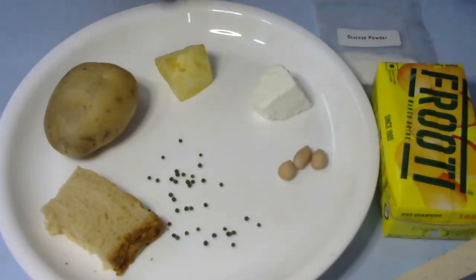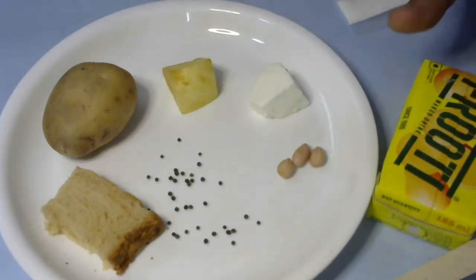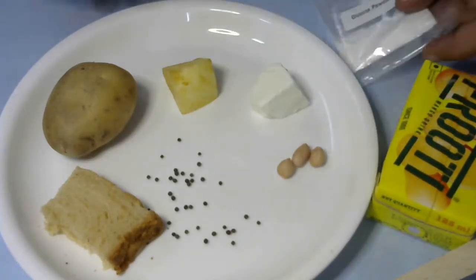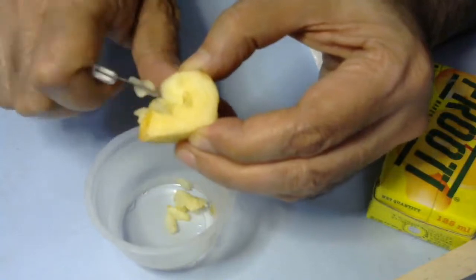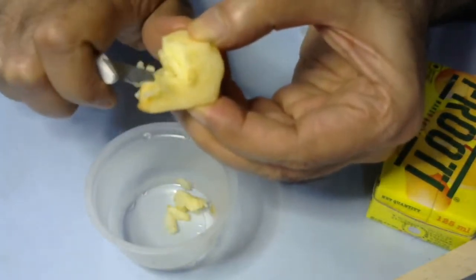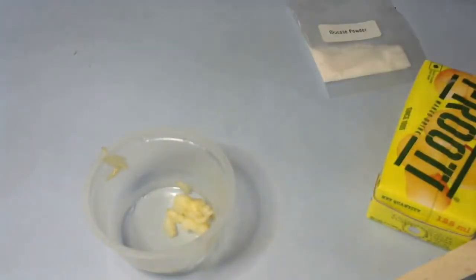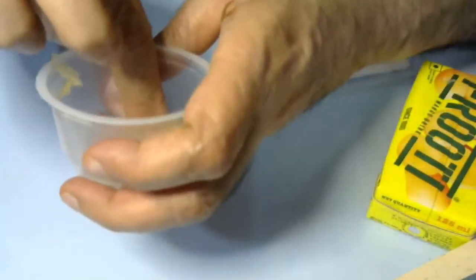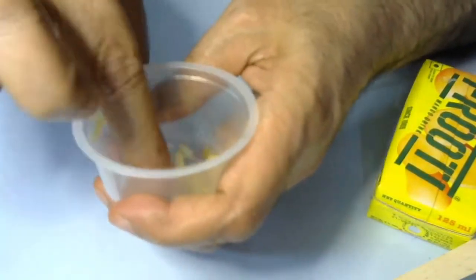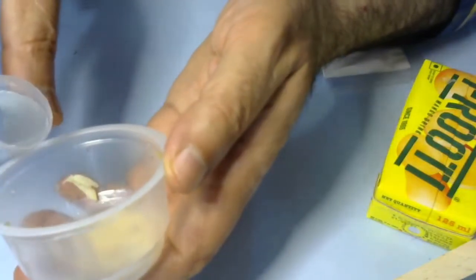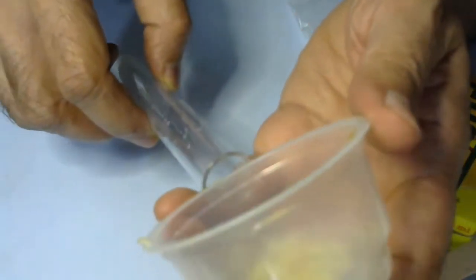We will start with glucose testing, for which we'll use one piece of apple, some fruit juice like this mango juice fruity, and actual glucose to see which comes out better. First, we're making very small pieces of this apple so it's easy to extract the juice. We'll crush it a little bit so the juice comes out, then add a little water and put this whole solution in the test tube.